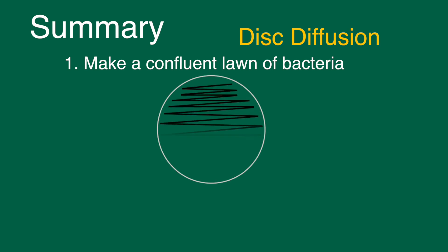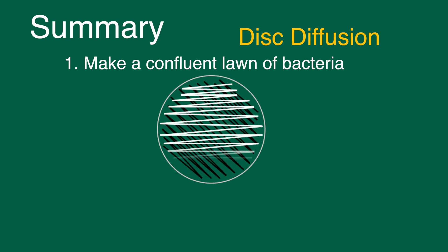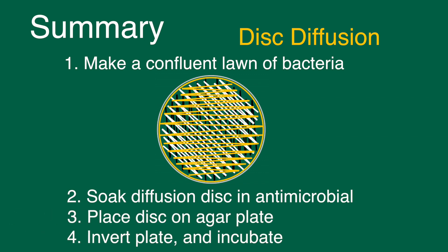In conclusion, to use this disc diffusion assay you begin by making a confluent lawn of bacteria. This is done by using a sterile swab, swabbing across the plate three to four times and once around the perimeter of the plate. Then take the appropriate diffusion disc, soak it in the antimicrobial agent, and place it gently onto your plate. Make sure to invert the plates as you incubate them.